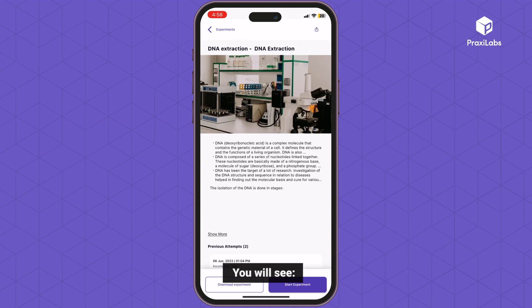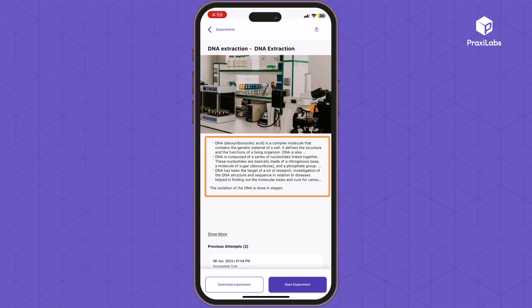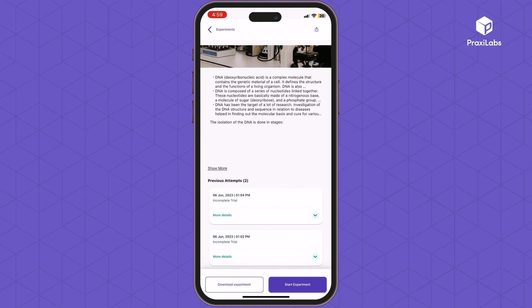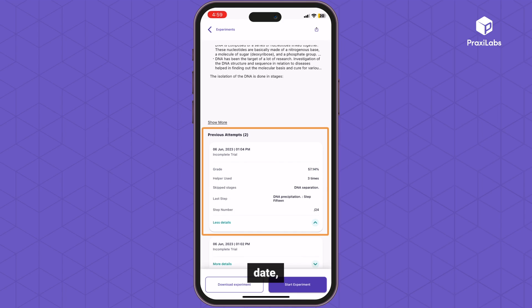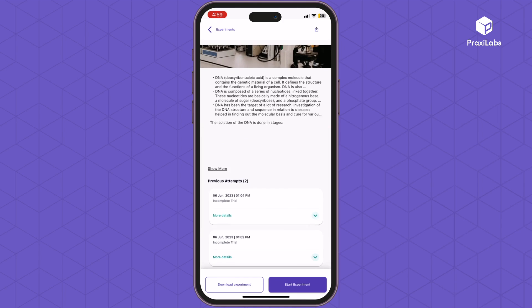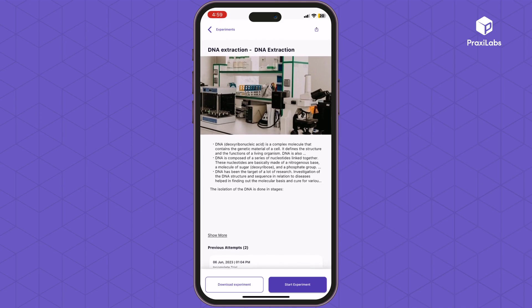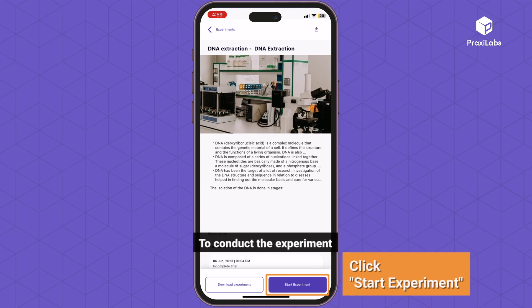You will see the experiment name, experiment description, and previous attempt details including date, time, duration, and grade. Click Start Experiment to conduct the experiment.